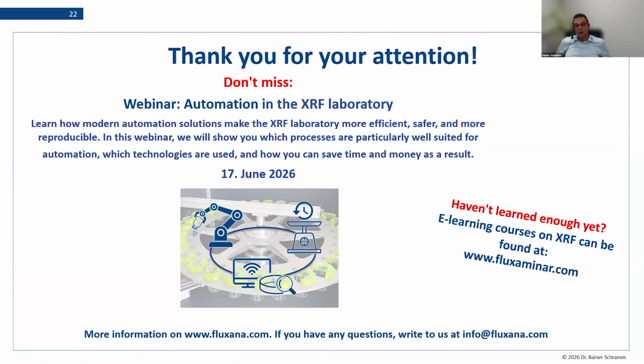So that means in the moment we include more and more sensors, we can help the user to better plan the long-term maintenance intervals he has to respect. And because the sensors are getting cheaper and cheaper and more available, and also software is more available, I'm expecting that in the near future this will also have an impact on such instrument developments.